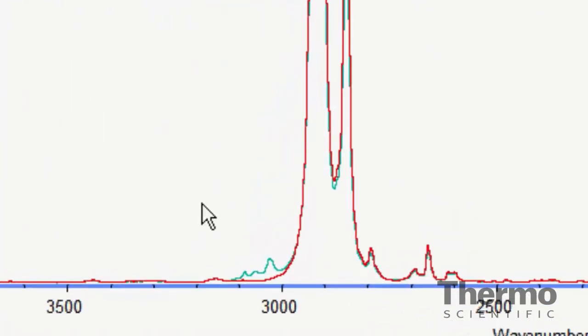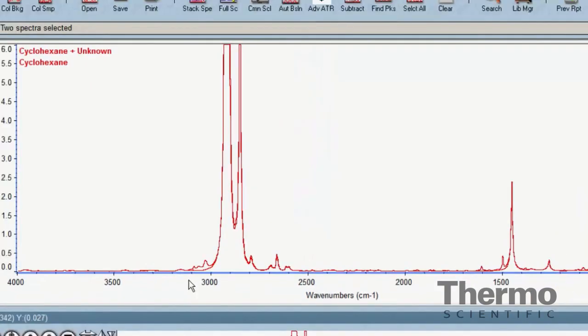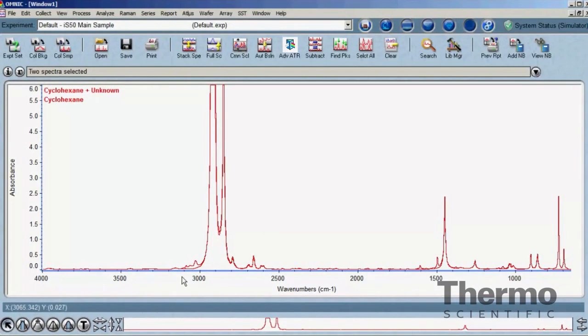The two spectra need to be selected in the Omnic window by clicking on the mixture spectrum first, and while holding the control key, click on the reference spectrum. The two datasets will then be selected in the correct order. The title bar will read two spectra selected, and the subtraction process can proceed.